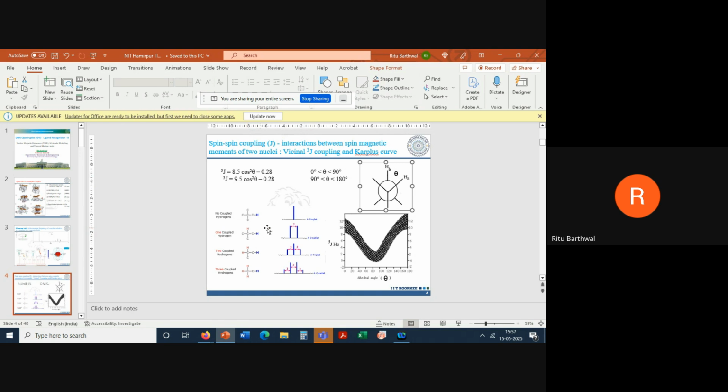So the blue H, which would have given you a spectral line over here, will never feel just that magnetic field. It feels a magnetic field which is slightly less and slightly more, both, because the red H is going through its transition. So this line splits into two lines, half of the time here, half of the time here.